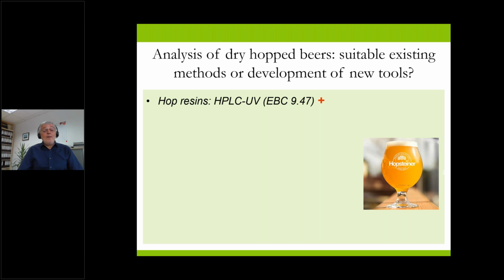Hop resins can be analyzed with an existing EBC method, and this is very good news. So it's very straightforward to analyze dry hop beers on the resins.